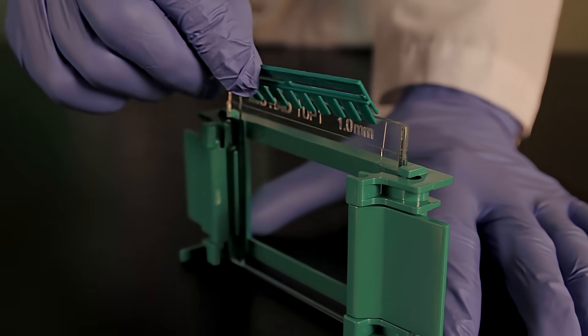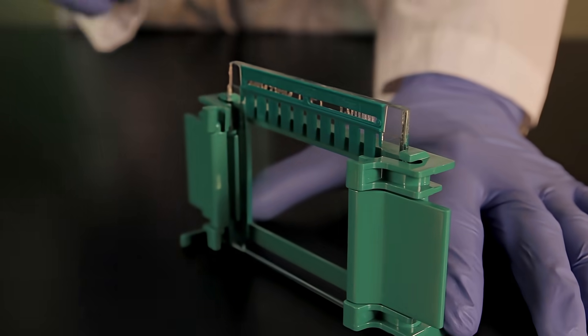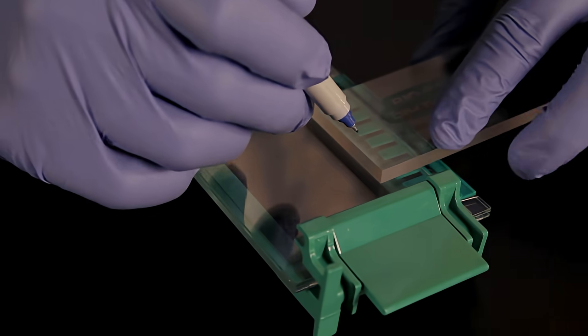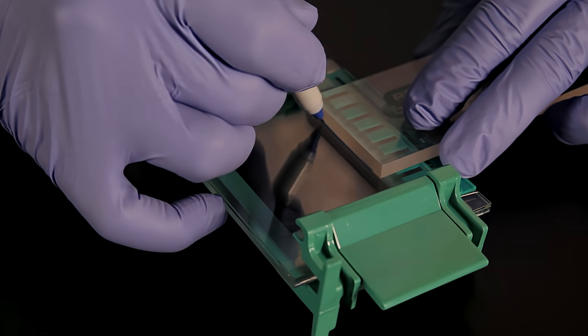Place the comb completely into the assembled gel cassette and mark the glass plate 0.5 cm below the teeth to indicate the level to which to pour the resolving gel.